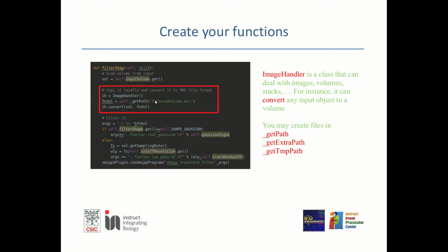The next thing I would like to highlight is how to deal with file formats. Nowadays most of the programs can deal with many different file formats, but some of them are written in a way that they only accept particular file formats.